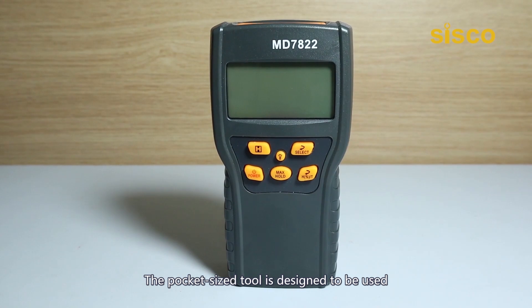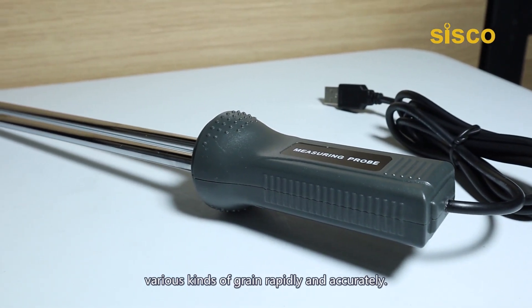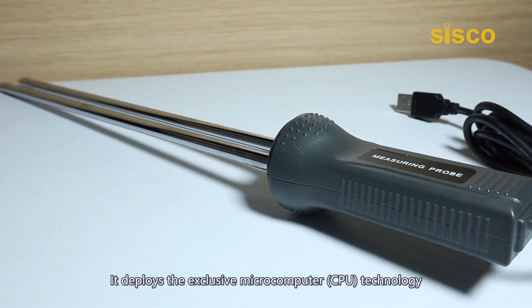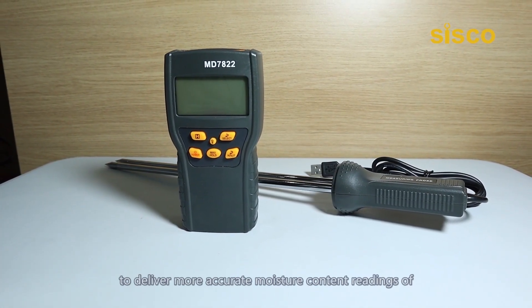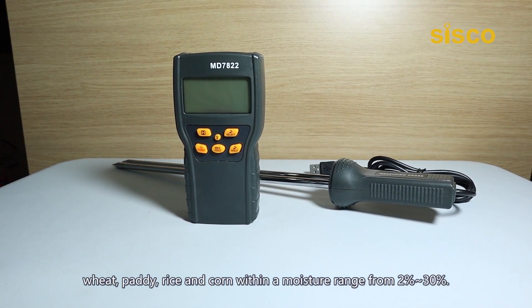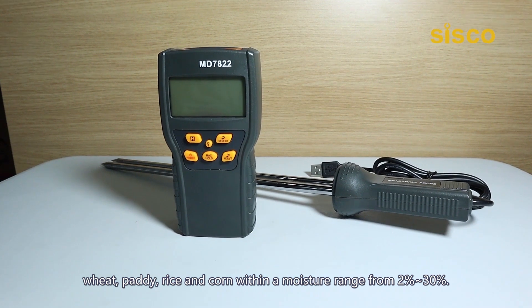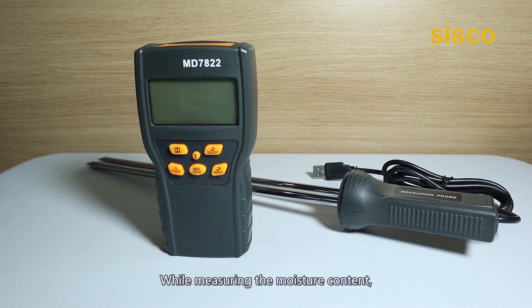The pocket-sized tool is designed to measure the moisture and temperature of various kinds of grain rapidly and accurately. It deploys exclusive microcomputer CPU technology to deliver more accurate moisture content readings of wheat, paddy, rice, and corn within a moisture range from 2% to 30%.